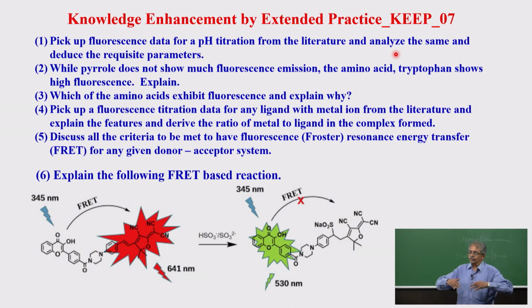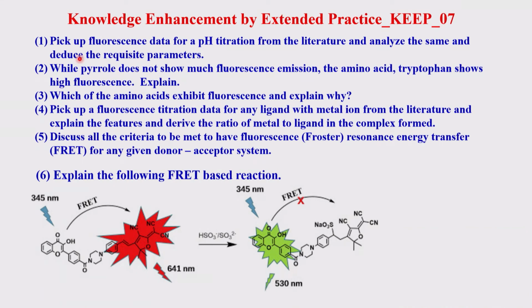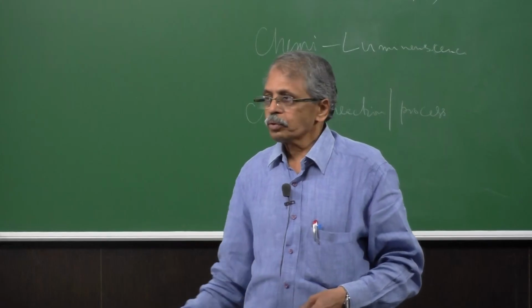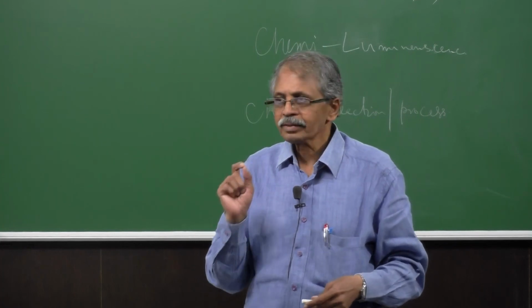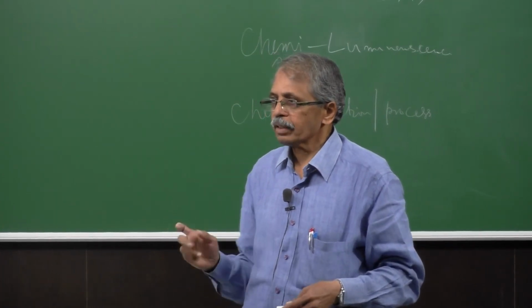In some cases the molecule can undergo different transitions, so you can get different pKa values. So it is not that you take one example; take at least a few examples. In some of them there is only one, in some there will be 2, 3, etc. So this query is not for one set of data, there can be multiple data.